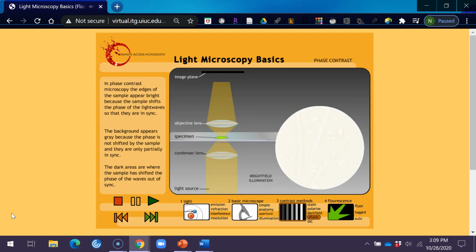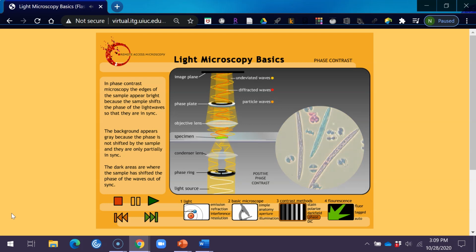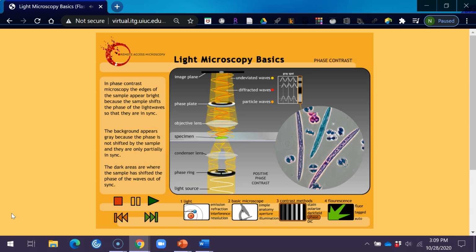In phase contrast microscopy, a ring of light illuminates the sample. When these light rays interact with the sample, some are bent, resulting in changes in path length for the light rays and phase retardation. A phase ring is used to change the phase of the unbent rays, maximizing the contrast that results from mixing the out-of-phase rays. Positive phase contrast is achieved by delaying the diffracted waves by 1/4 wavelength. This produces a dark image on a light background.